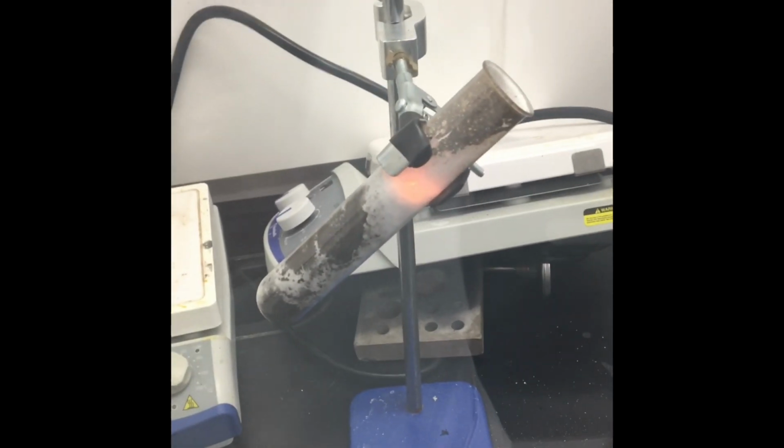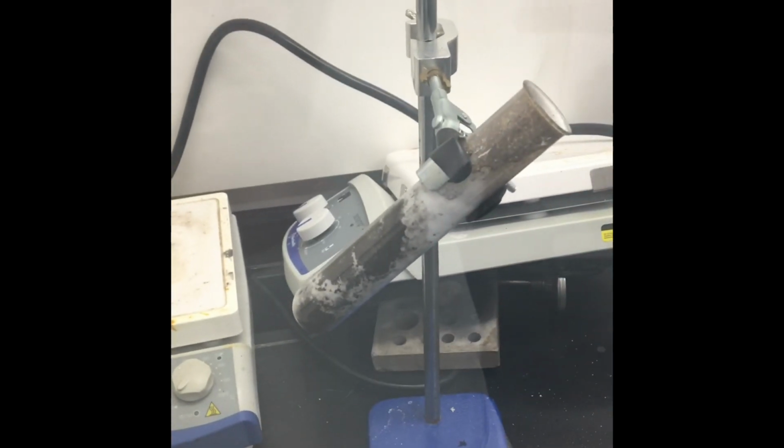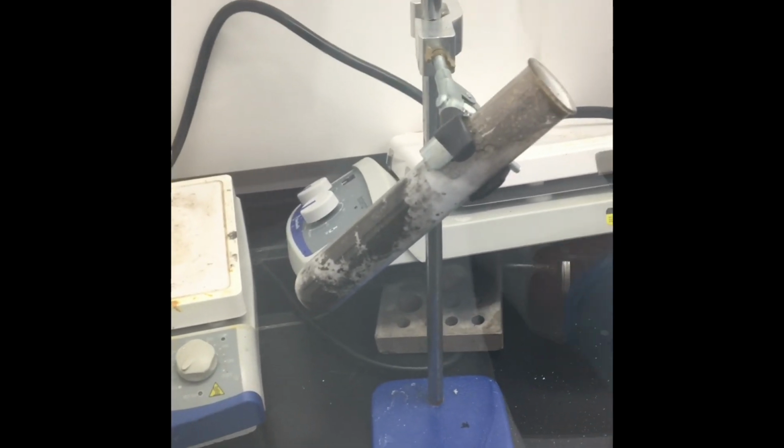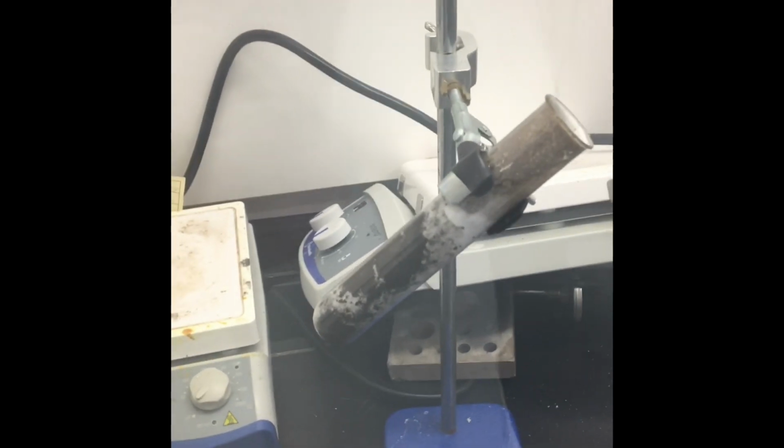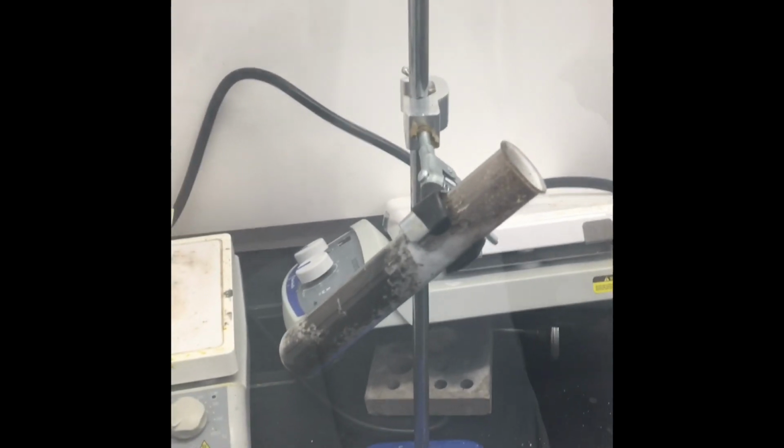It's just because we have more of the potassium chlorate, therefore I produce more oxygen when I melted it. And then the Swedish fish is bigger in size, so it has more mass, and therefore it contains more sugar. So what we saw is, again, more intense, and there's a lot of smoke inside the hood.